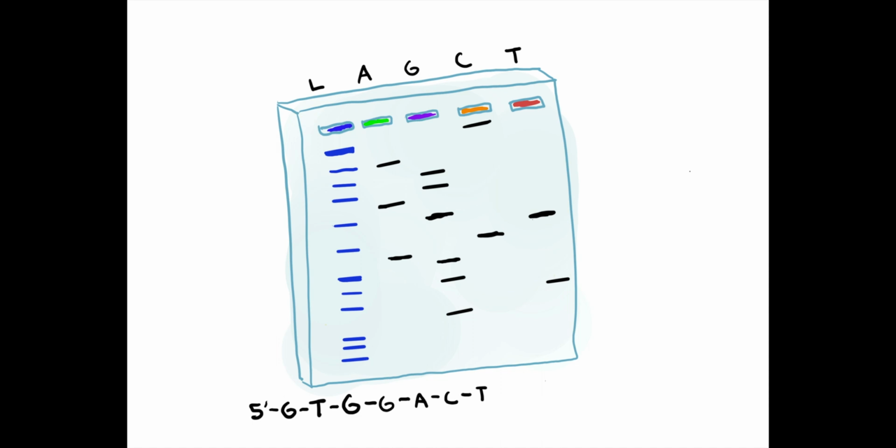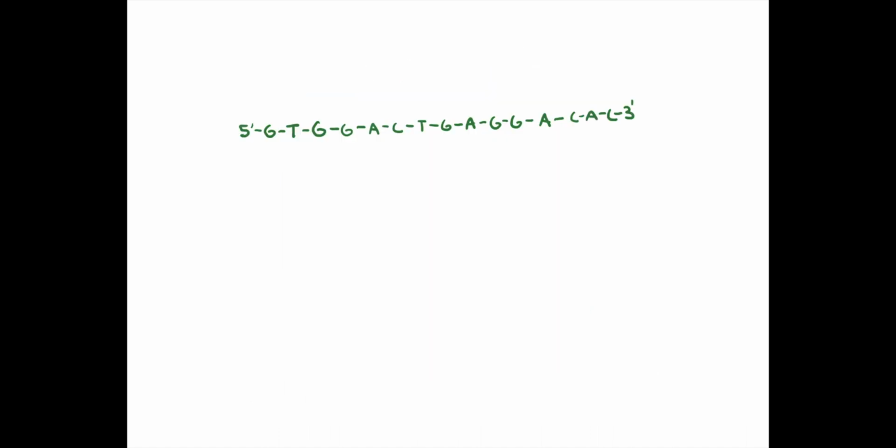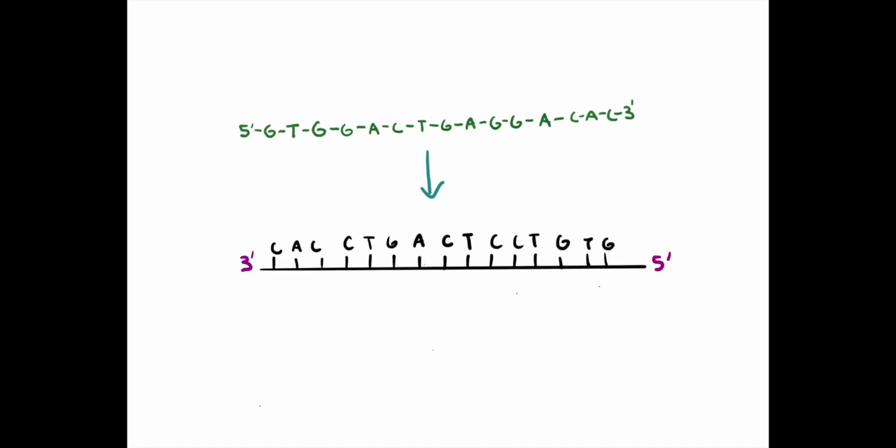So we are going to take our sequence, and we find the complementary bases to find the original template strand. So the strand that we synthesize is complementary to the strand that we were reading from in the beginning. And what do you know? The exon that we are looking at is for sickle cell anemia. Specifically, this exon is part of the beta globin gene, and normally it is supposed to be an A in the wild type, which will code for glutamic acid, but in sickle cell anemia, it is a T instead, and so that is going to code for a valine instead.